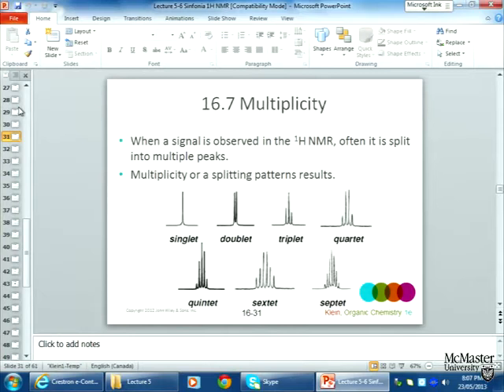All right, so we've seen how in carbon NMR we can use chemical shift to tell us about the environment of the carbons. In proton NMR we can use proton chemical shift, the shift of nuclei, to tell us about the environment of hydrogen atoms in a molecule. So we can determine information about two of the most important atoms in organic chemistry, because almost everything has carbon and hydrogen in it. Right? It's more difficult to do NMR on other interesting elements.